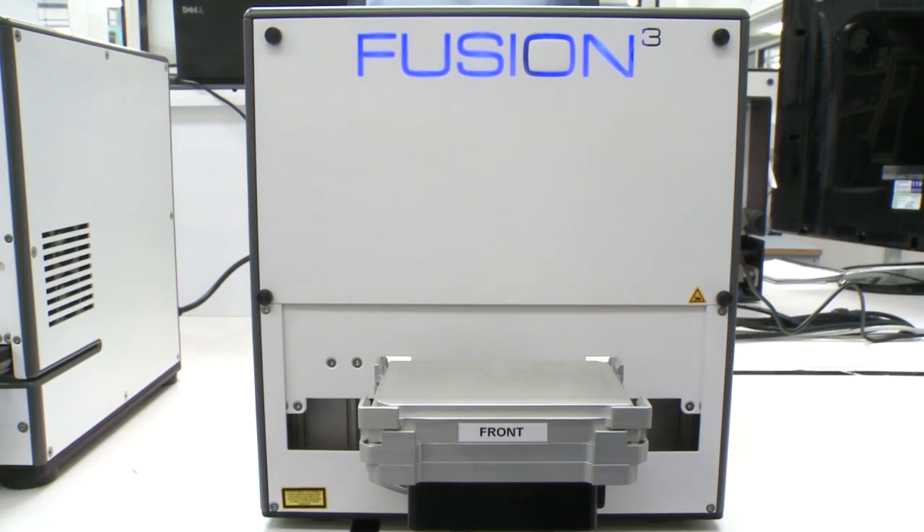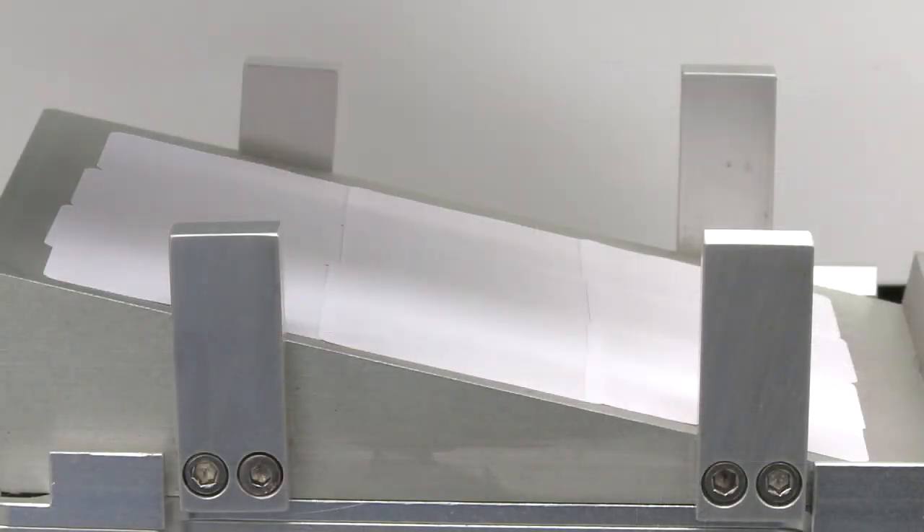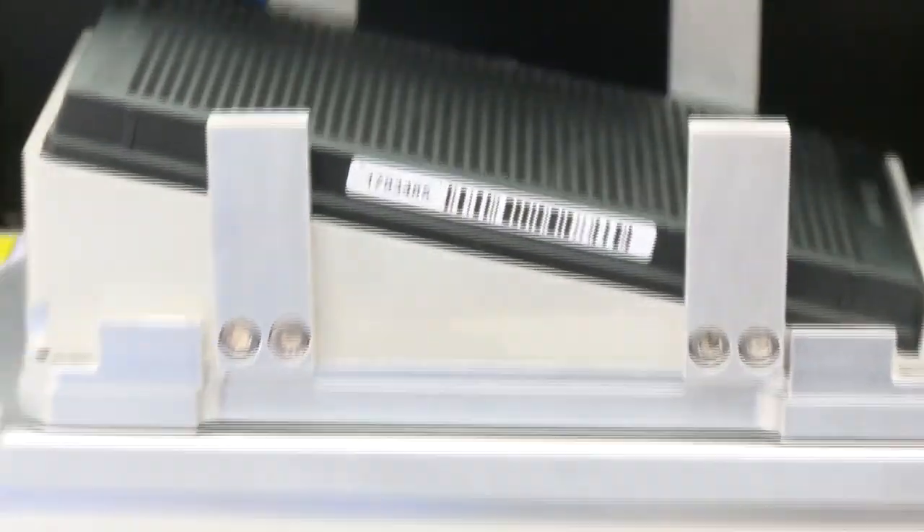Fusion 3 is our patented cold weld laser sealing system that utilizes an optically clear film to seal plates permanently, both air and watertight. This system can work with plates up to a density of 1536, and the optically clear film gives you unparalleled clarity of data whether using luminescence, fluorescence, or other reporter systems. The Fusion 3 sealing system was originally developed by us to increase throughput using ultra-high-density 1536 plates.